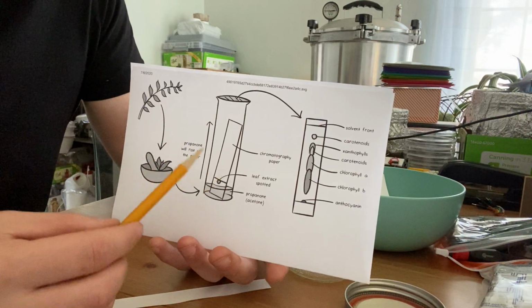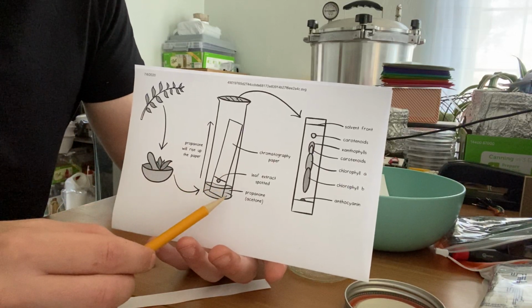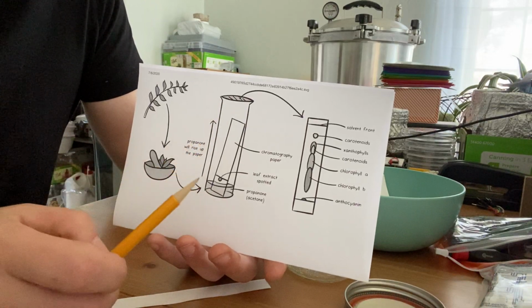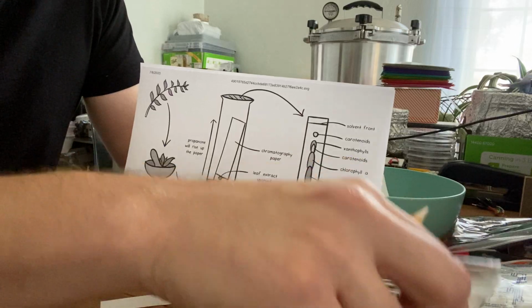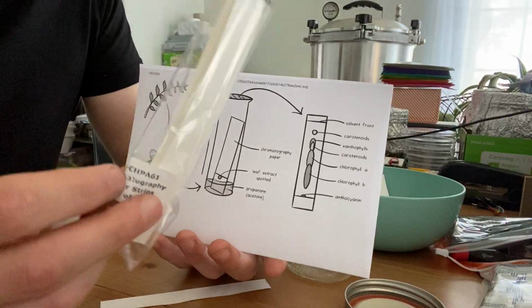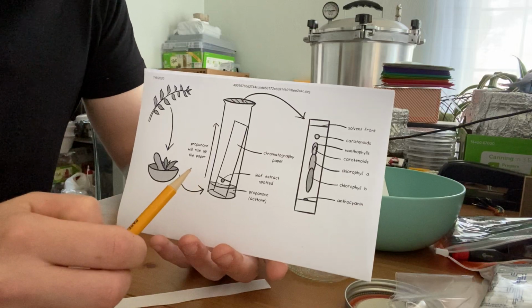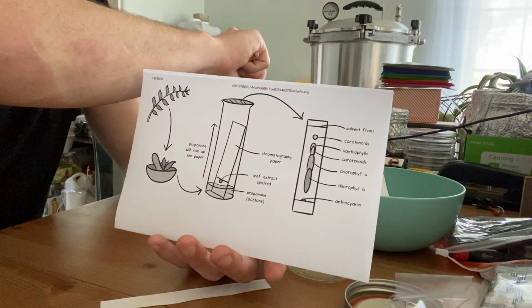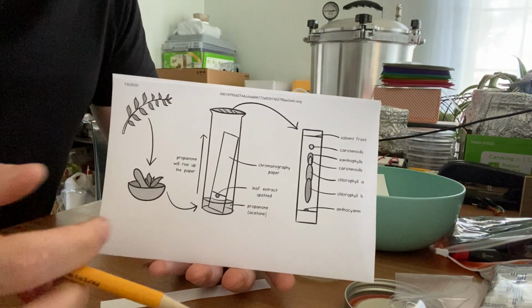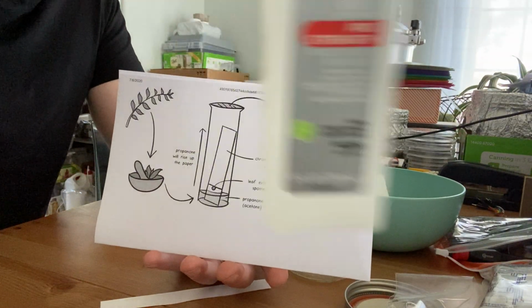So with thin layer chromatography, we basically have a glass jar, which acts as our developing chamber, a solvent on the bottom, which we call our mobile phase, and then we have our stationary phase, which is going to be, in our case, in this experiment that we're about to run, a thin piece of paper. This is a chromatography paper. It's cellulose and it's quite polar. So we're going to be taking some ash leaf, which I have from a tree that I received outside, crushing it up, and then putting it in some solvent, which happens to be some acetone, nail polish remover.